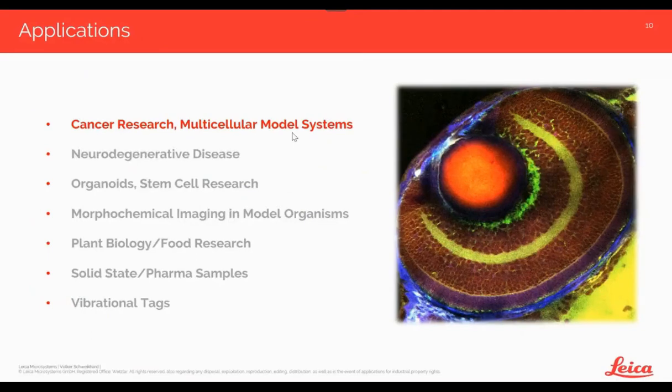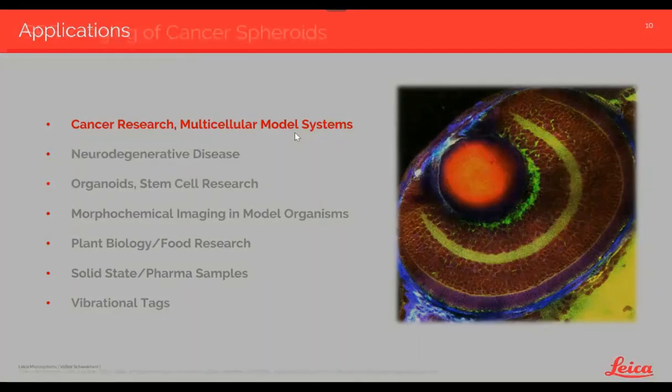And with this background, I want to actually shift towards presenting you a few of the key applications that we have identified for this type of imaging approach. And I want to begin with showing you some examples from the field of cancer research on multicellular model systems.